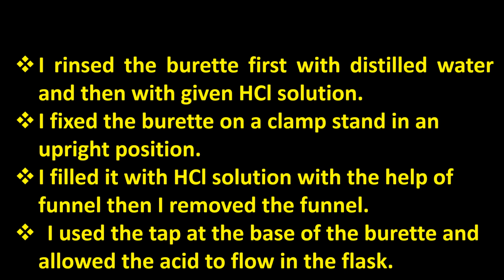Now I have to move towards the burette. I rinse the burette first with distilled water and then with the given hydrochloric acid solution. Why am I rinsing the burette with HCl solution and the conical flask with sodium hydroxide solution? Because I have to take hydrochloric acid solution in the burette and sodium hydroxide solution in the flask. So it will be better for me to rinse with the water as well as with the solutions which have to be taken in the apparatus.